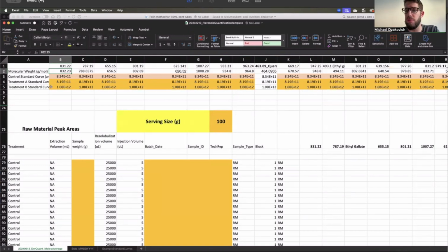And then I've set up this spreadsheet for a very likely scenario where you've had to run samples on multiple days. And so we talked about in the last couple videos converting our peak areas into more normalized peak area based on taxofolin as our internal standard. We talked about how mass specs are pretty variable day to day, and even within a day. And so this is certainly the case if you're looking between days or sometimes you're running samples weeks apart. We always have to run a standard curve with a batch of samples to take into account any changes in the instrument.